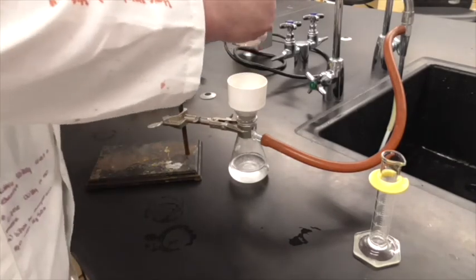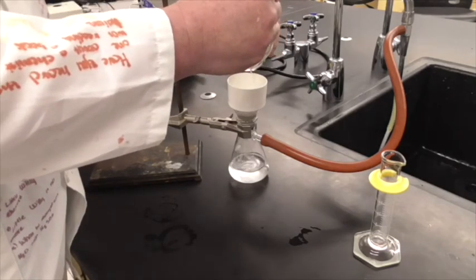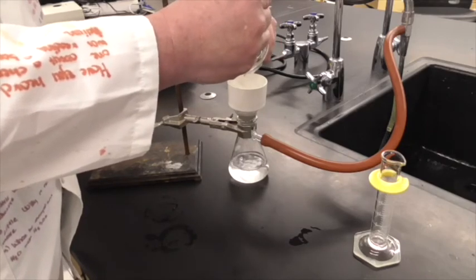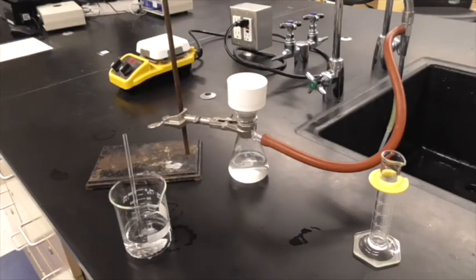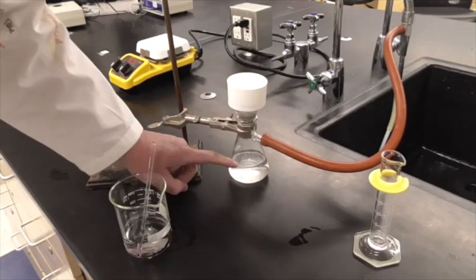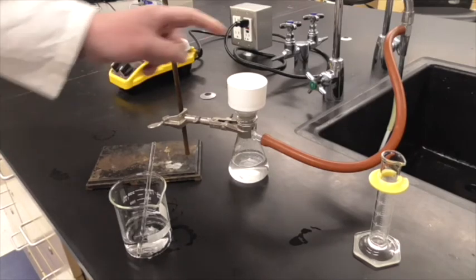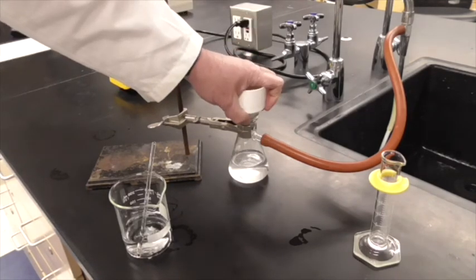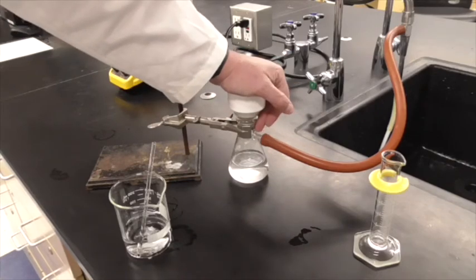I'm going to pour a little bit of cold water on the top here just to rinse the aspirin off a little bit. Make sure everything that isn't aspirin is kind of washed through. We can see there's a little bit of solid that got through. Must have been really fine particles. But most of our aspirin is up top. So we're going to let that pull vacuum a little bit to try to get as much liquid out of there as we can.